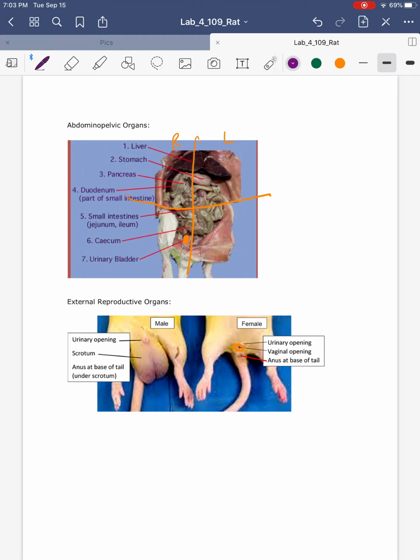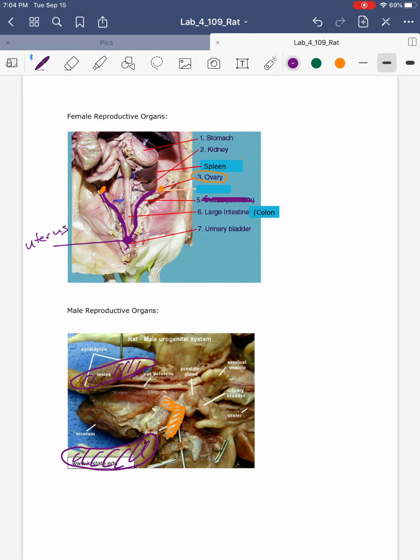So here's a picture of the external anatomy. Look at the testes. Here's one testy, and then here's another. They hang outside the male, but they're proportionately really big. Can you imagine if it was the same proportion in humans? The male testes would be dragging on the ground.